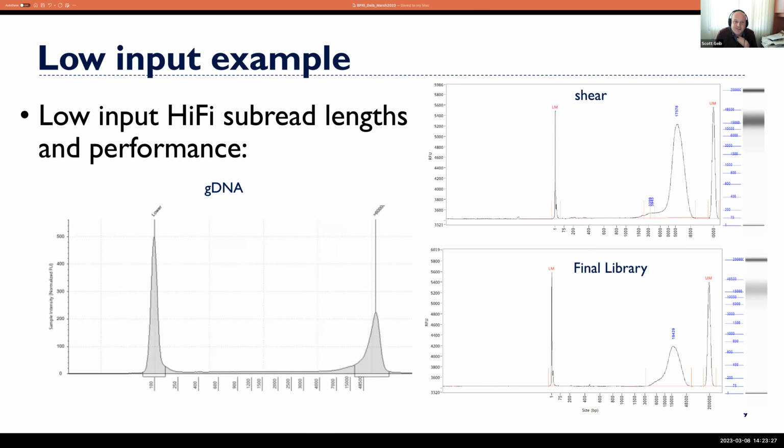It's a little bit crap in, crap out too. If the DNA is sheared, it probably also has a lot of nicks and a lot of damage. During the library prep steps, there are steps to repair the DNA, but trying to save it with size selection is just not going to do the trick. You'd have shorter DNA that's maybe damaged throughout, so the polymerase isn't going to be able to go around, and the yield of that run might be lower. So the question will be, can we get a better sample coming in?